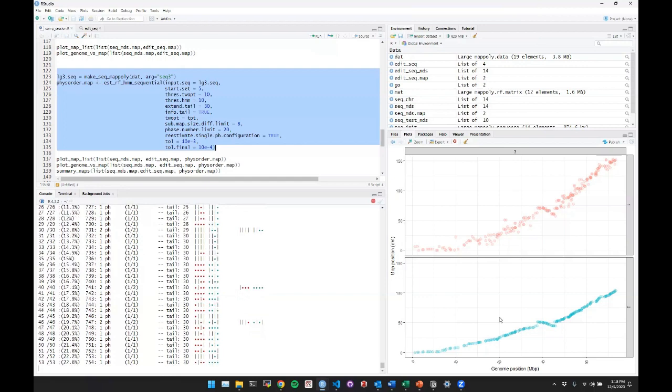And we'll see. I'd like to make a comment regarding the question. The germplasm that we use for mapping may come from germplasm where the reference genome that we use is not a direct, I guess, comparator.